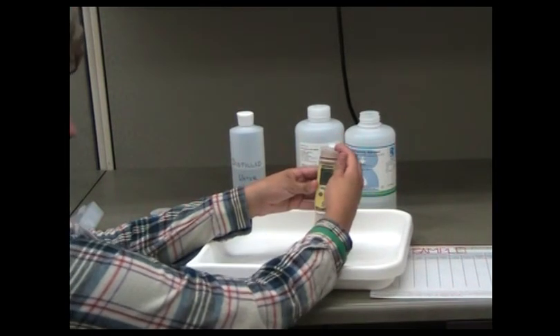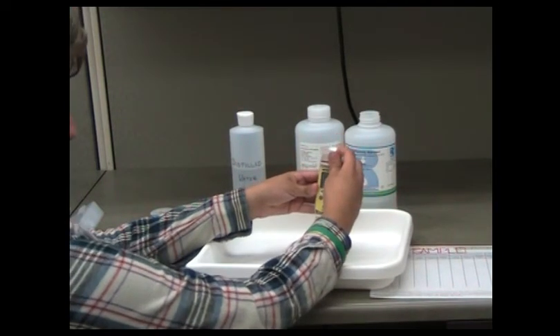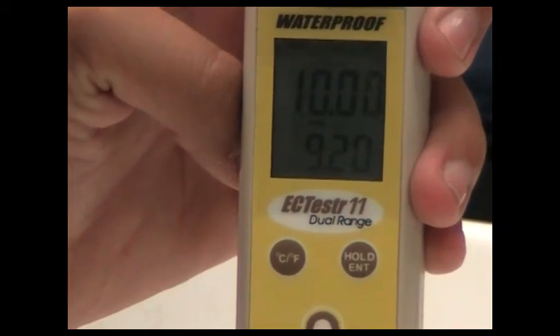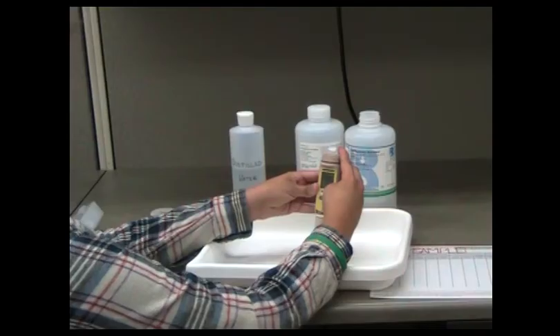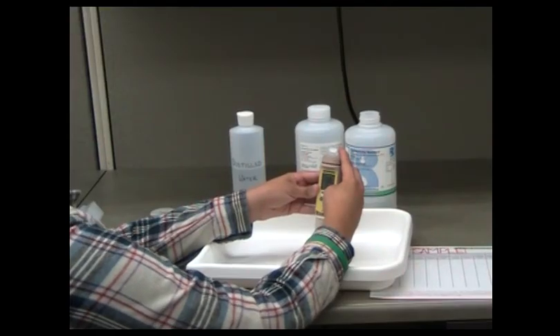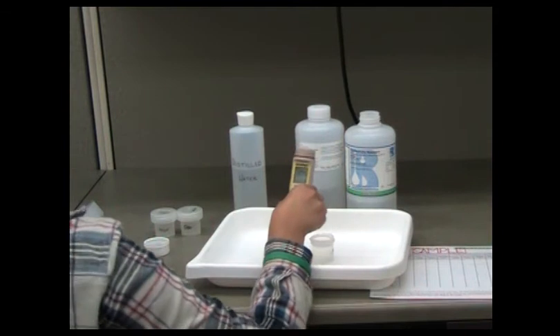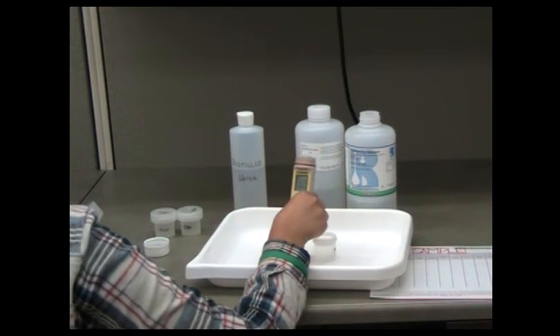Wait a moment to allow the meter to recognize this calibrated value. When the meter has recognized the value set, it will display CO and return to measuring mode. If the meter flashes CO before you have corrected the value and a correction was needed, you should re-enter calibration mode and retry this step.